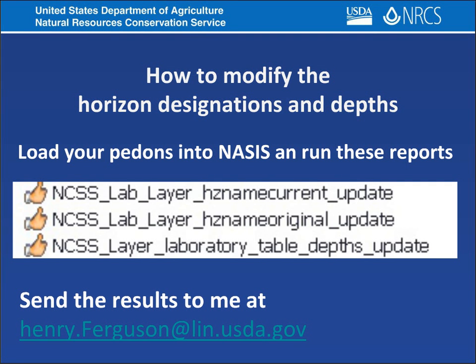They can load their data and run the NCSS Lab Layer Horizon Current Update, the NCSS Lab Layer Horizon Name Original Update, or the NCSS Layer Laboratory Table Depth Update. If they run those reports, it provides me with a file that they can save, and I can run that against the database, and it will update that table in NASIS. I would only do the update if, number one, the fix has to be made in the first place, and number two, it has to meet our current standards.